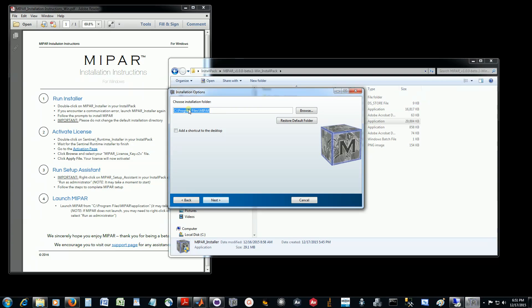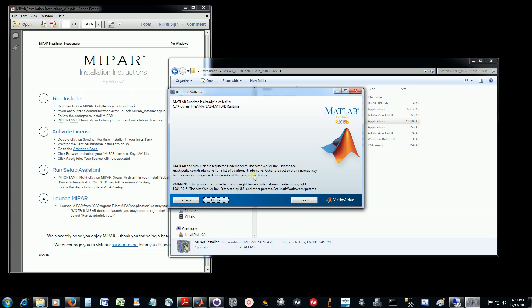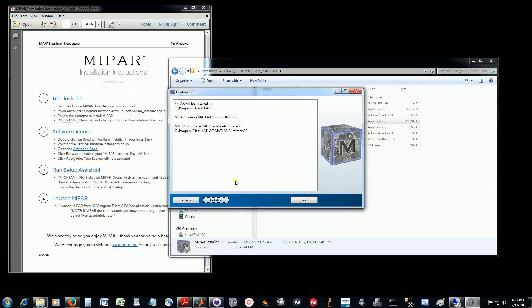Here is the default installation directory that it populates. Please leave this as it is, and we can choose to add a shortcut to the desktop if we'd like. This will download and install MATLAB runtime, as MyPAR is a MATLAB-based application that is deployed and executed like any other stand-alone application. We'll just click next and choose to install.